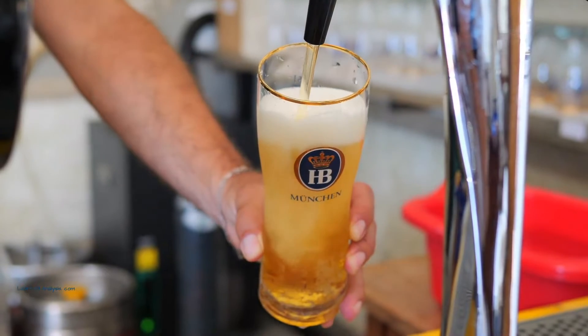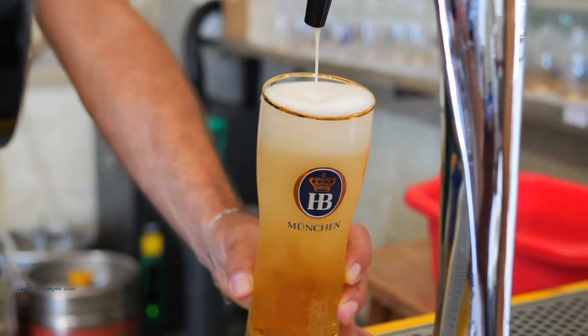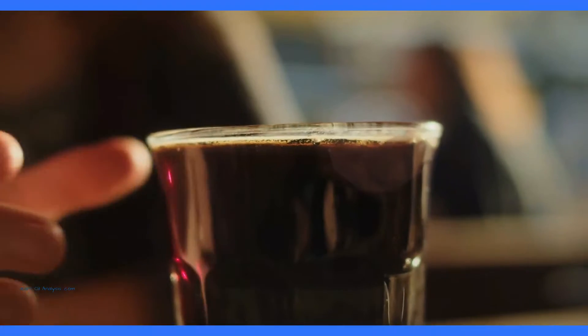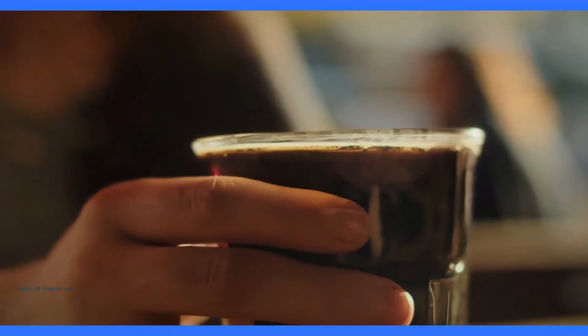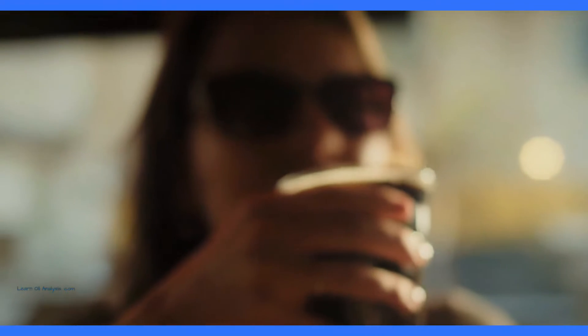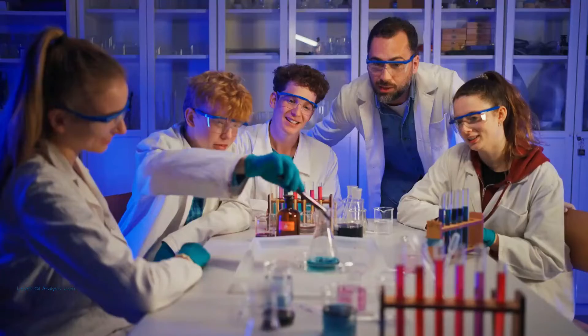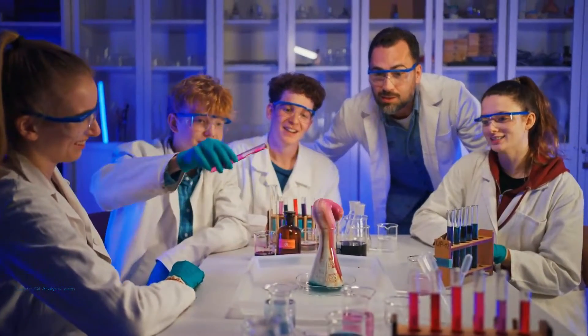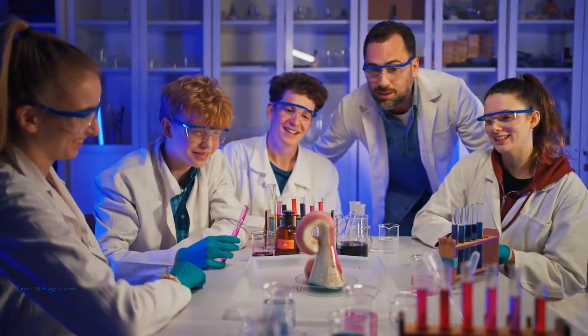In beer terms, the tendency is the head of the beer in mill after the pint is poured. And stability is after you have left it on the bar for 5 minutes before drinking. We measure these at specific, controlled temperatures and set numbers of times. Sounds like a fun school science experiment, right? Well, it is.